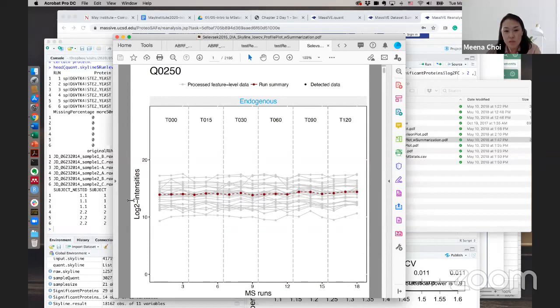However, for visualization, in the profile plot we always separate by group. For example, in a group comparison case, not the paired design, each one should be different. But here for the time course design, we assume 1, 2, 3, 1, 2, 3 is matching. I think this is a good idea. We just label for time courses instead of MS run, or also plus the biological replicate. Okay, we will try to update this. Comparison design wise, we always compare between the time points of the time course.